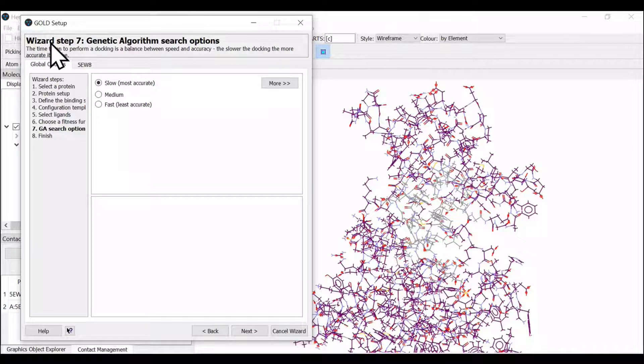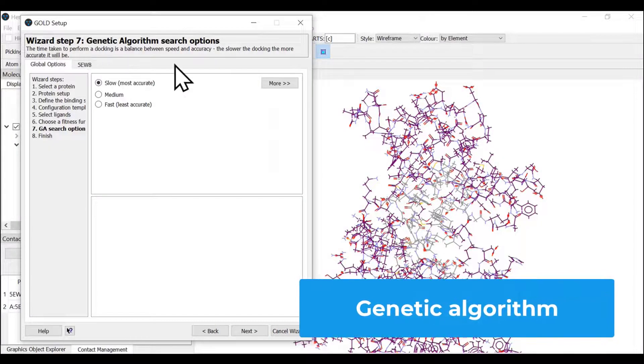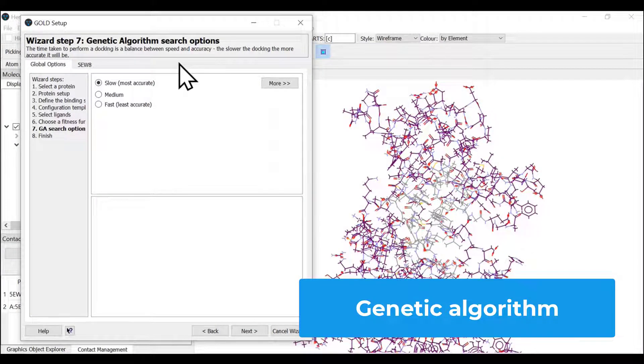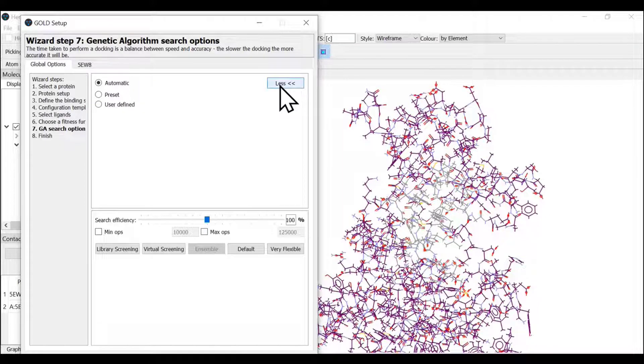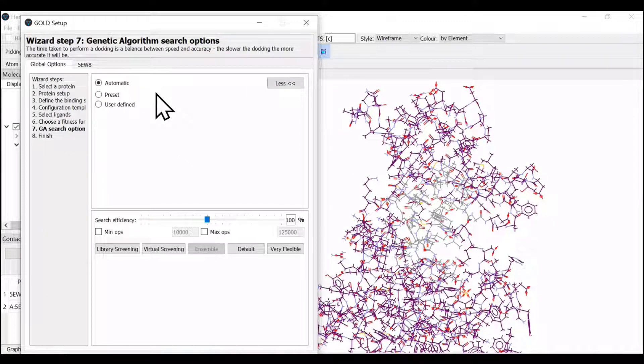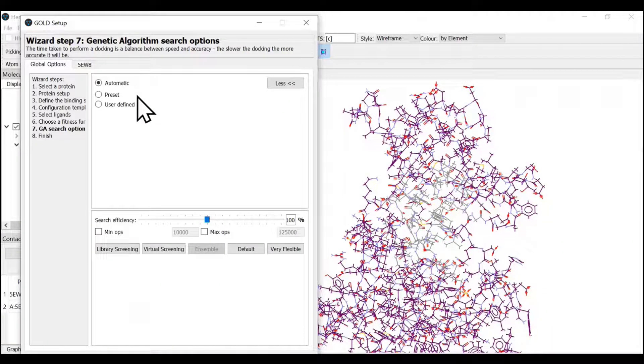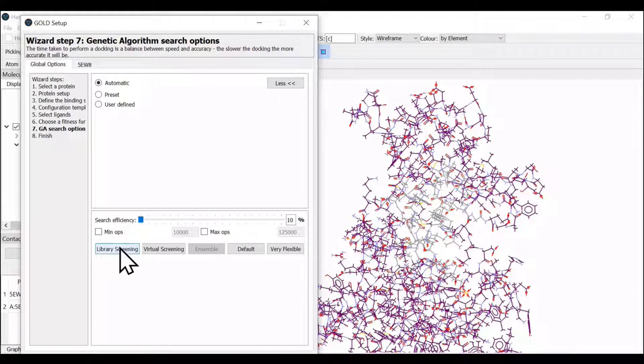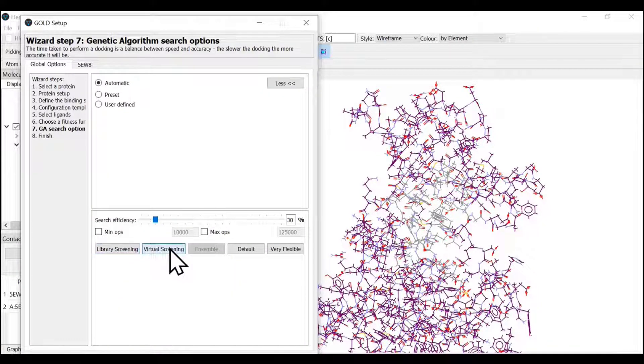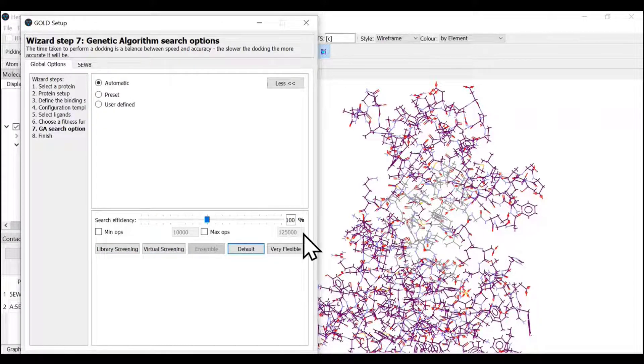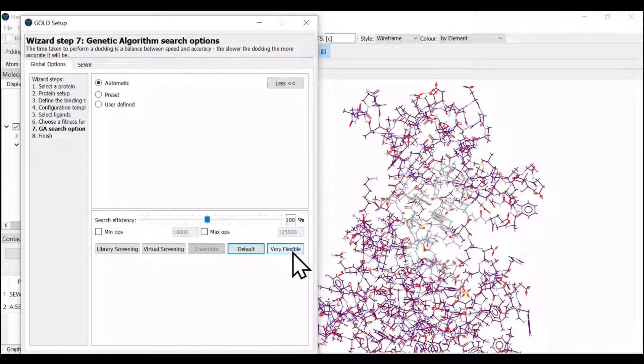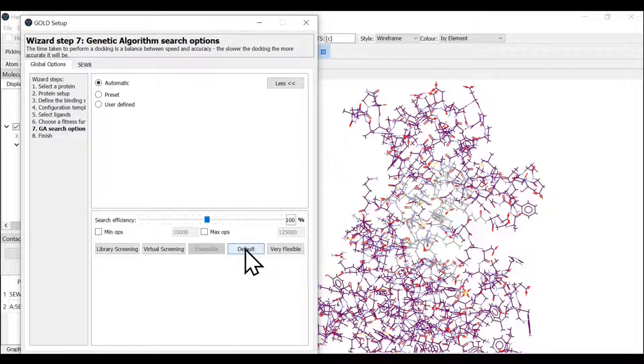Wizard step 7 is genetic algorithm search option. If we click on more, we see several options for performing the docking exercise. You may select library screening for large volumes of ligands, or virtual screening. You can select default search efficiency and speed, or very flexible for maximum iterations in GOLD. We're going with the default since we have only one ligand.